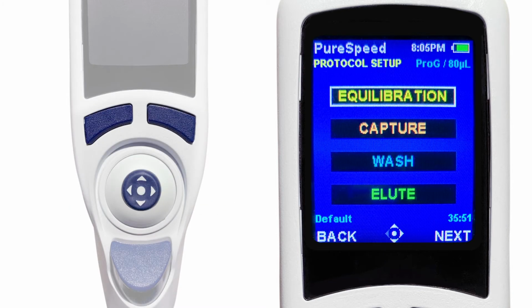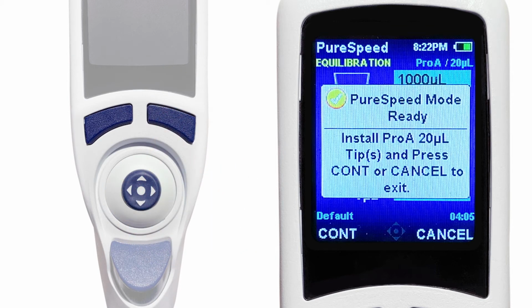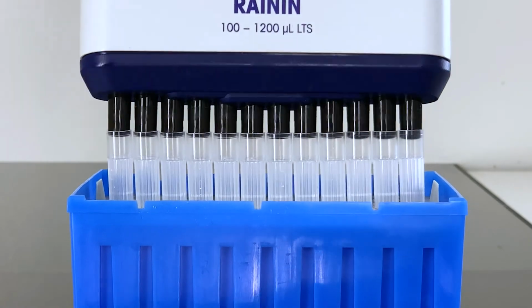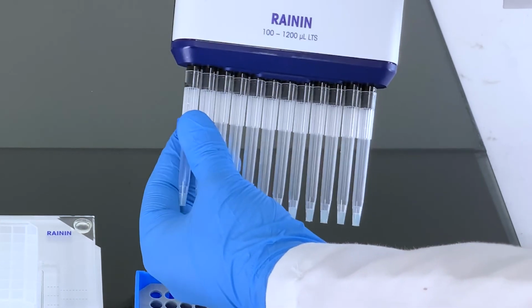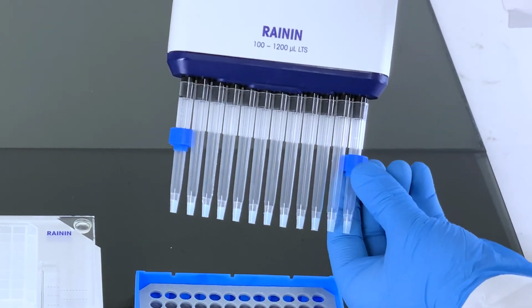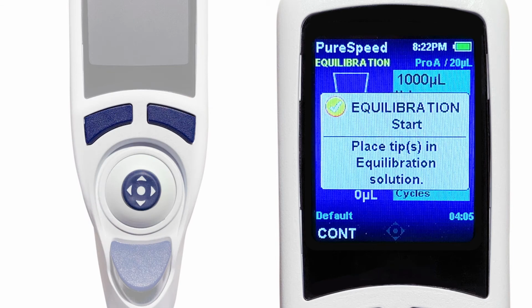Press the right button under the screen to select equilibration. Press Run to start your method run. The pipette will give you directions to install the proper tips. Place your pipette on top of the PhyTip columns and press down to make sure they are fully secured. Then push the appropriate adapters fully into first tip on each end. Use blue adapters for 1000 microliter columns and green adapters for 200 microliter columns. Then press the left button under the screen to select Continue.